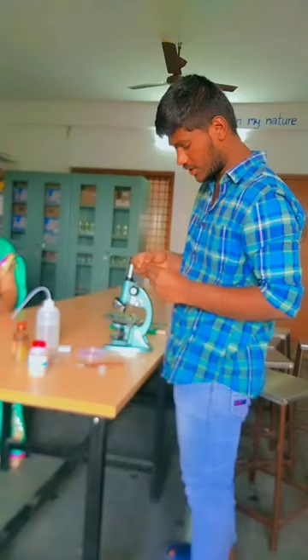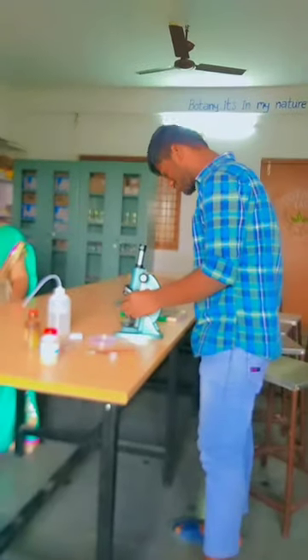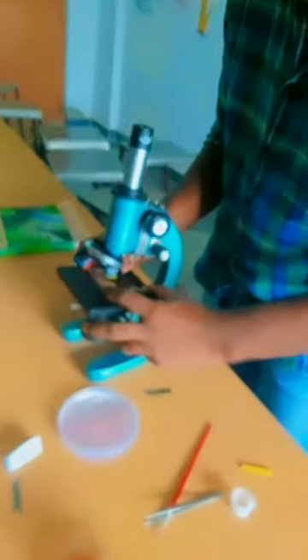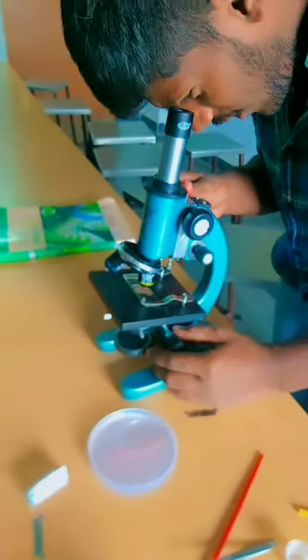Put the cover slip on the slide and observe under the microscope. We have to adjust the lenses properly to get a clear view.